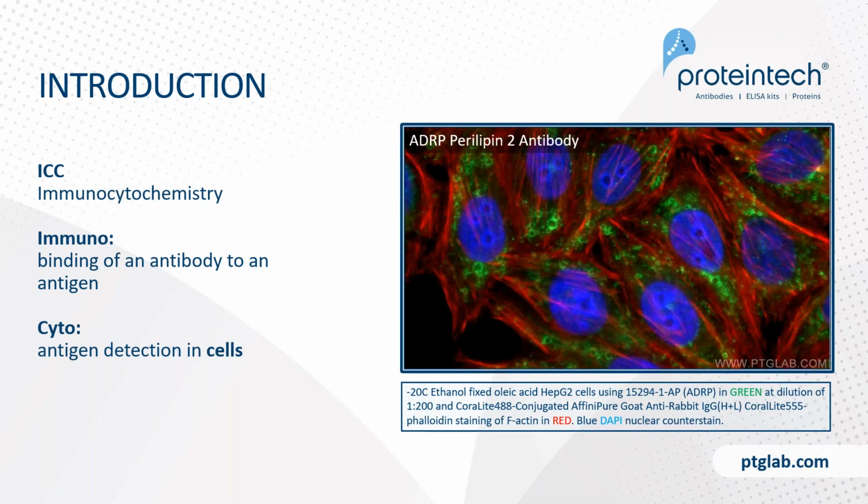Another acronym that you might see is ICC. ICC is immunocytochemistry, which simply refers to the binding of an antibody to an antigen within cells, so antigen detection within cells. Here we have HepG2 cells, stained in green by the perilipin-2 antibody and in red by the common cytoskeletal protein actin.